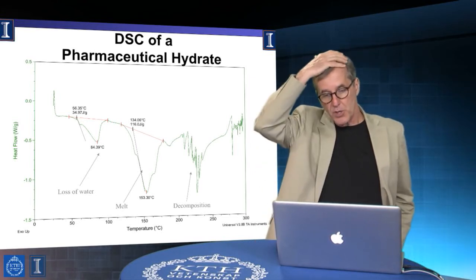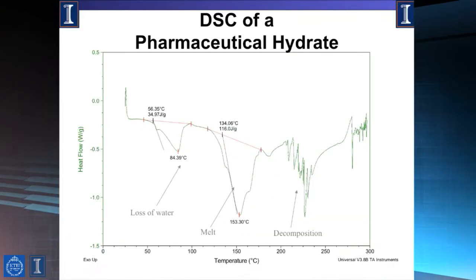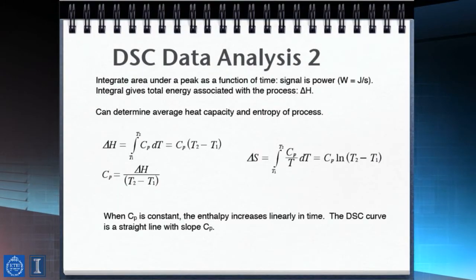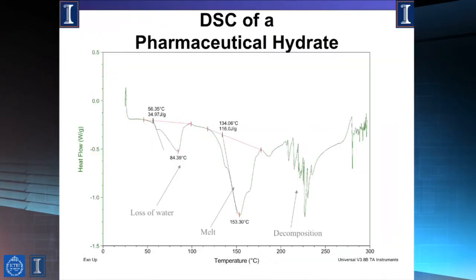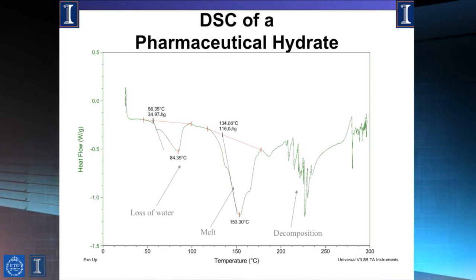And this actually shows, in point of fact, how we can use that measurement to deduce features of the underlying thermodynamics. So I showed these line traces being superimposed. And in point of fact, in the extended slide set, there are examples that lay this out. Typically what you do is you run a measurement, and the software is very good, and it tells you these outcomes as readouts.